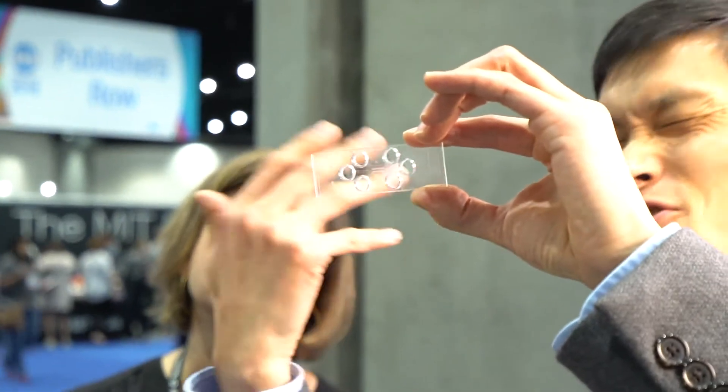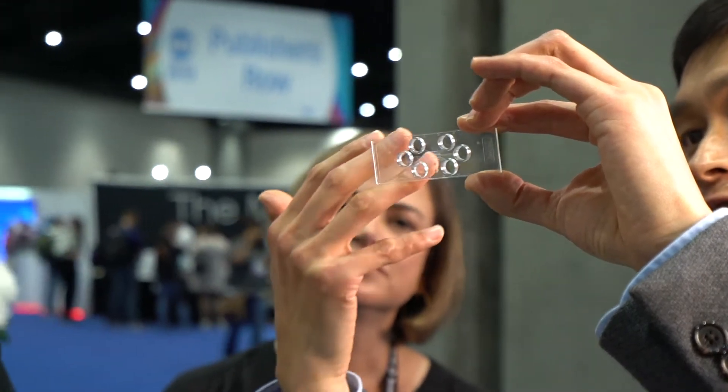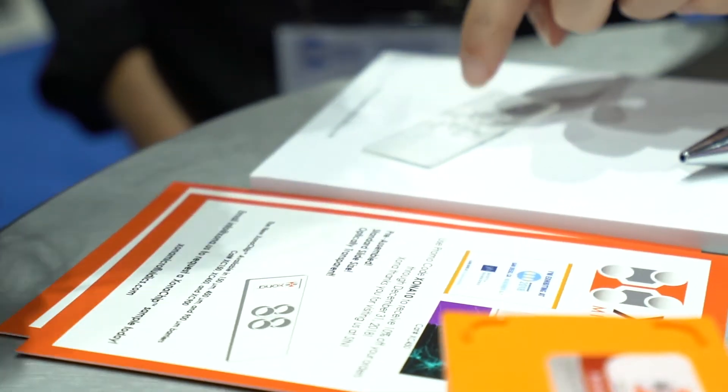We recently launched the new Zona chip that's fabricated out of optically transparent plastic, that's pre-assembled and requires no bonding. This is something our customers have been asking about for years — to have a pre-assembled product ready to use — and we're finally able to deliver it and we're really happy about it.